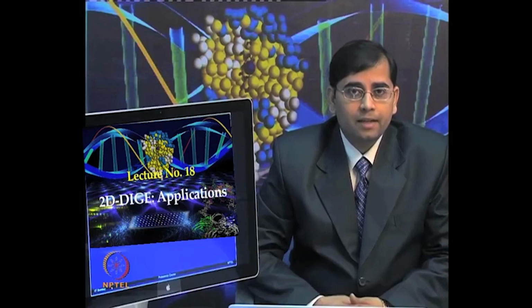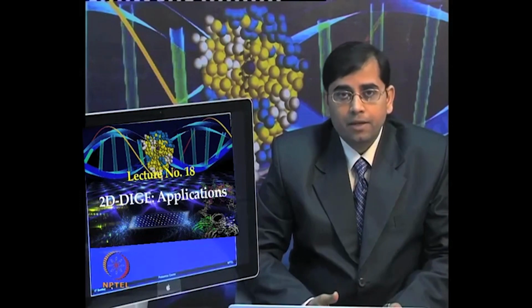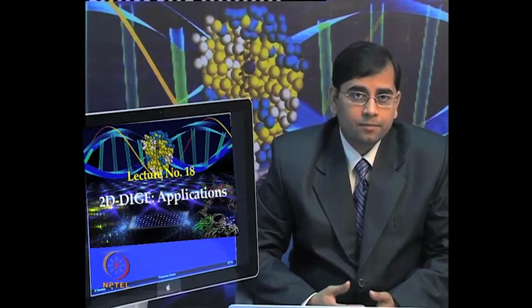I hope that at the end of this module and lecture, you will be able to perform a gel based proteomics experiment. But please keep in mind, these protocols and methods only give you a feel for performing these experiments. Each experiment, each sample type, each biological question brings its own unique challenges, and depending upon those conditions and your sample type, you need to optimize these methods.